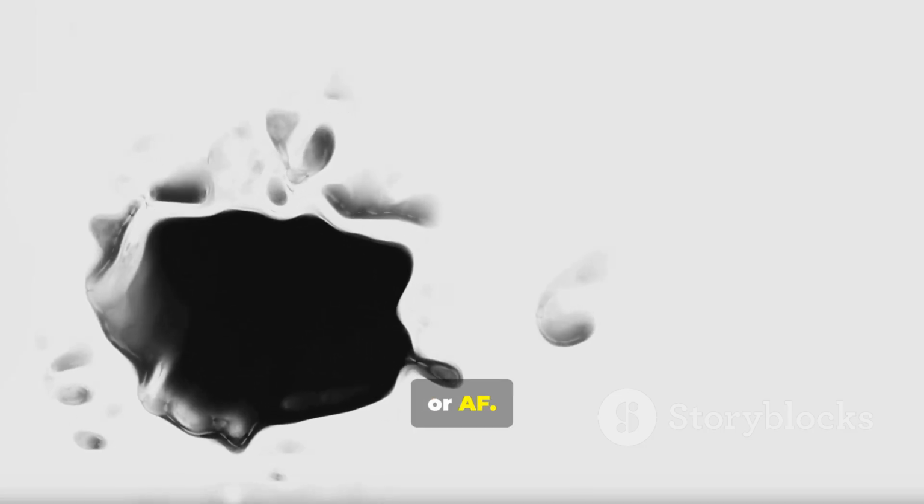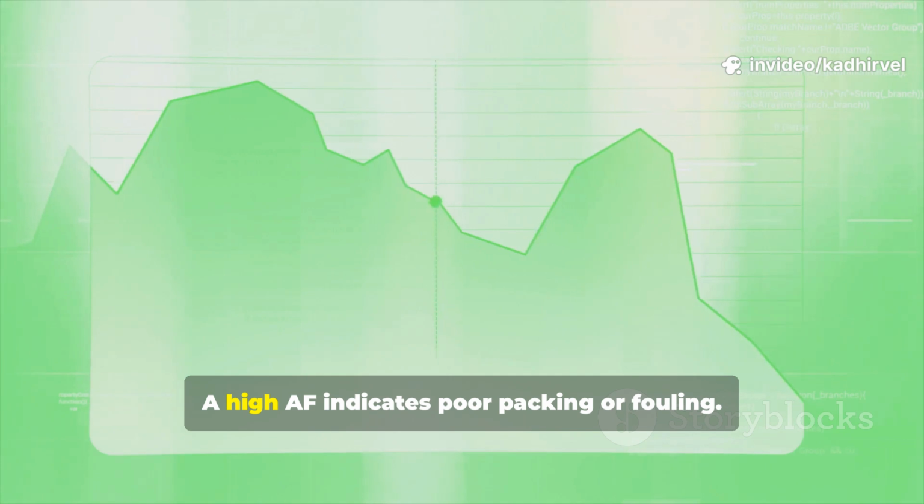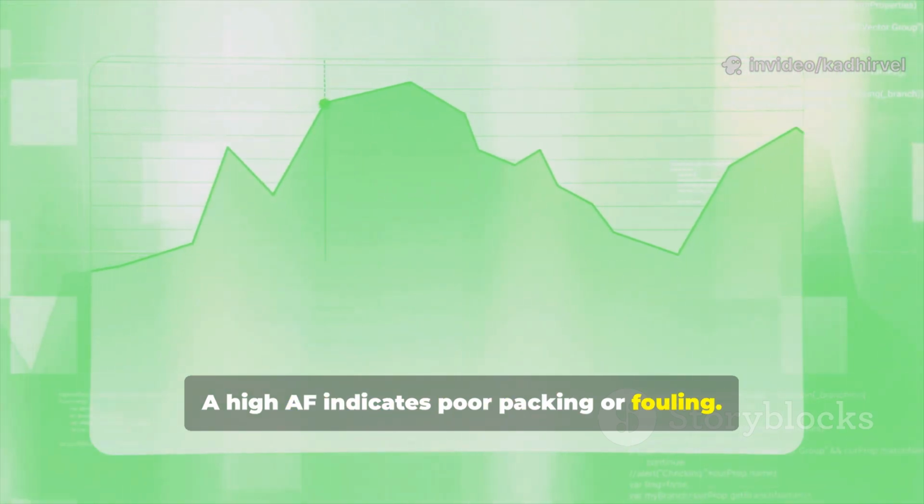Asymmetry factor, or AF. AF checks the peak shape. Ideal AF is between 0.8 and 1.5. A high AF indicates poor packing or fouling.